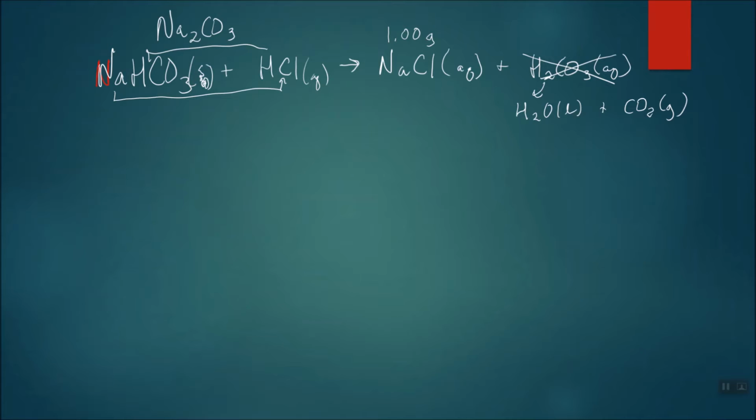How much? Well, to tell you the truth, at this point, you really do not know how to deal with the stoichiometry, the numbers game around soluble materials such as acids. This is something that we will encounter later on when we talk about concentration, when we talk about molarity. So we really only have one choice here. We have sodium bicarbonate.